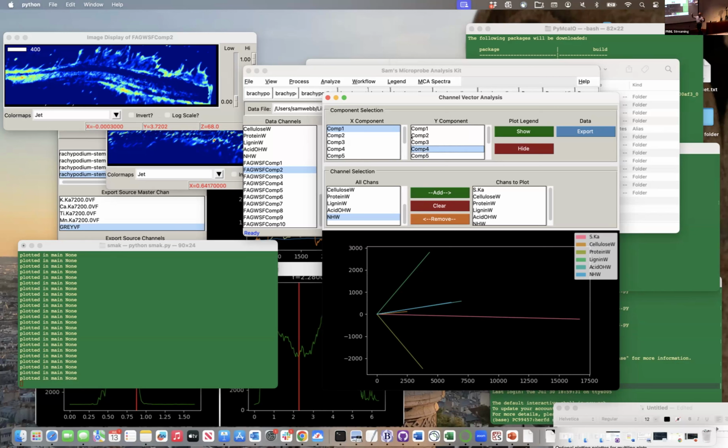to try to see if we could get some good data to show in this workshop, to show how we can do this. And I think it really does show the importance, if you want to do this for a really good experiment, of taking just an extra 10 minutes to think, okay, how exactly am I going to get this from point A to point B and make sure that we don't have sample artifacts, right? This is a really great lesson learned in a lot of ways, and a nice proof of what worked well and what we want to improve on.